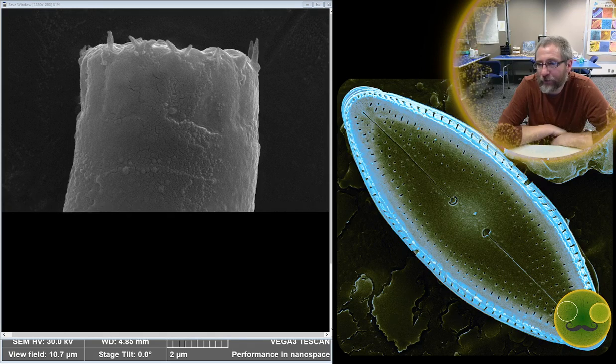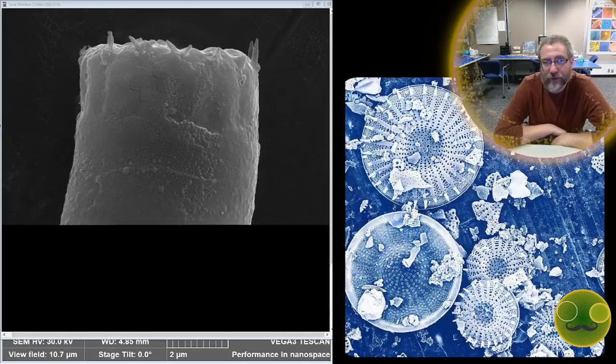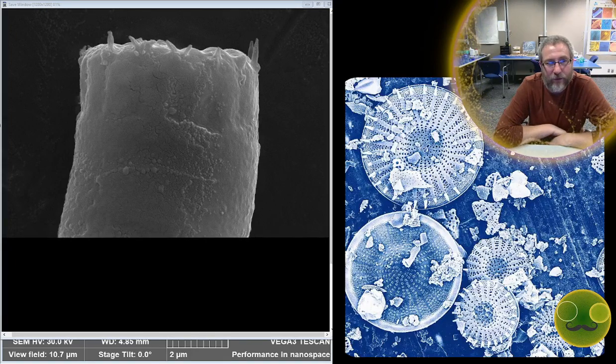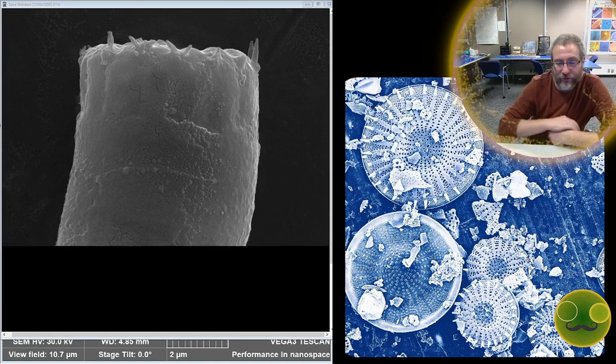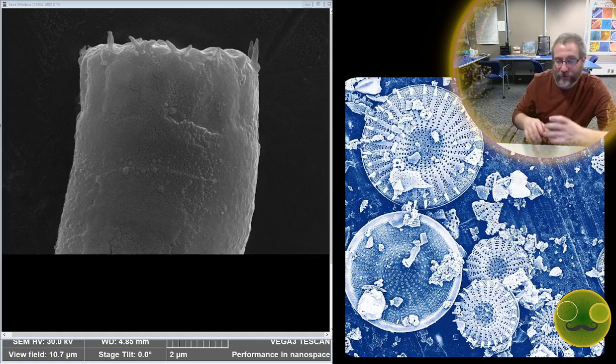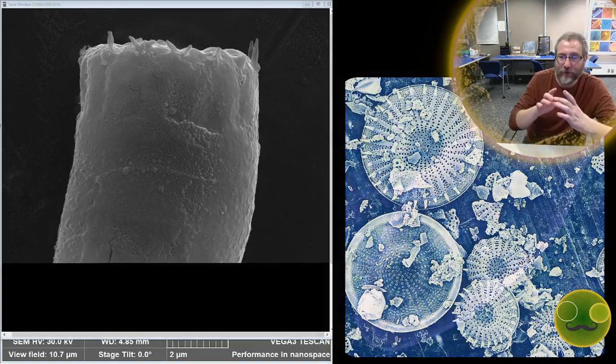I didn't know if it was the vector info or the initial electron combined with the reflected electron that gives the topography. It's just the secondary electrons that give you topography. So the only thing it's doing is basically like light would reflect to your eye. It's doing the same thing. It's just capturing electrons that are coming off of the material.